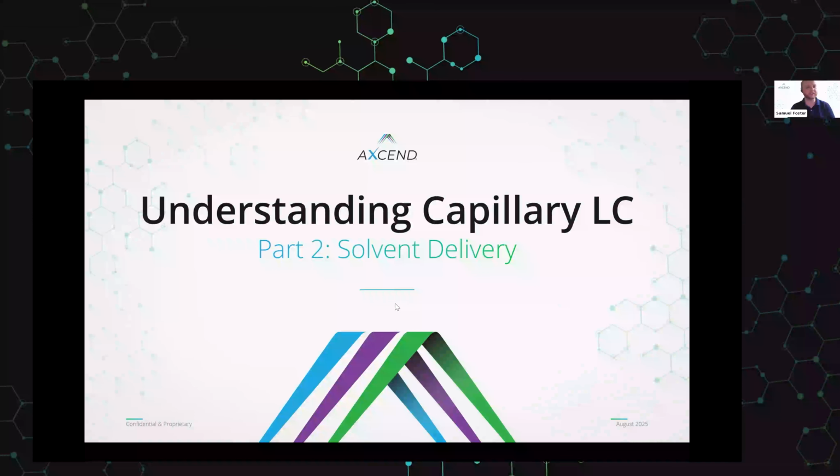I'm Sam Foster, an application scientist here at Axcend. And we are going to be doing this series called Understanding Capillary LC with the goal to describe the various differences of capillary scale versus some of the more traditional analytical or prep scale HPLC systems that are out there. Last time we were joined by Dr. James Grinius, and we gave a very broad overview of the field that's on the Axcend website if you want to catch up. This week, we're going to be focusing primarily on solvent delivery systems and really the differences that come from shifting down to the lower flow rates associated with capillary scale.